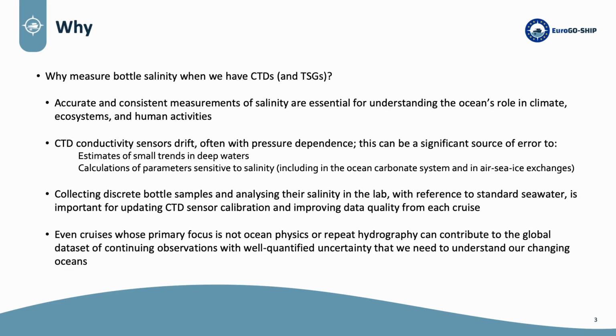So why measure bottle salinity? Well, first we need high-quality measurements of salinity to understand not only ocean physical processes, but also biogeochemical processes. We commonly derive salinity from conductivity and temperature, and the sensors we have available for these are very good, but they do drift, or sometimes even shift.